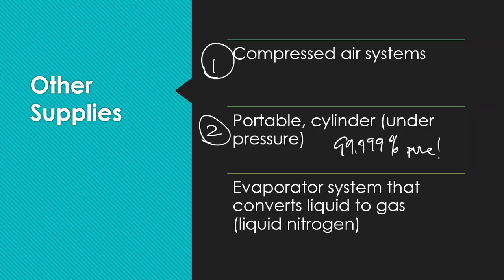5-9er gas, please. So when I call Airgas up on Carolina Beach Road here in Wilmington, I'm going to say, hey, listen, I need to order this gas. It's for an instrumentation piece that we have in our laboratory setting. I need 5-9ers, and they know exactly what I'm referring to with that. 99.999% pure. Sometimes I don't need that purity level. However, sometimes I do. So there are different ranges of purities, as you can imagine, and the purer you go, the more expensive most of the time those tanks are going to be.